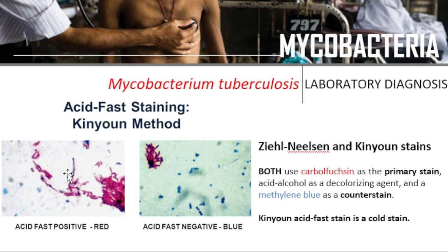So when the methylene blue, the counterstain, is added to this smear, the bacteria will not appear blue, it will appear red. Now, compared with the acid-fast negative bacteria, since they don't have mycolic acid, with the presence of the decolorizer, the carbolfuchsin, the primary stain, is removed. So that's why they take up the counterstain, methylene blue. Okay, so take note of the two.